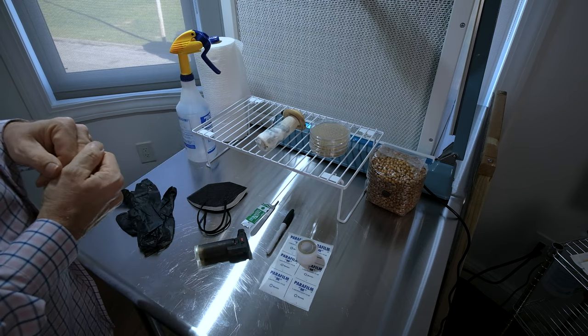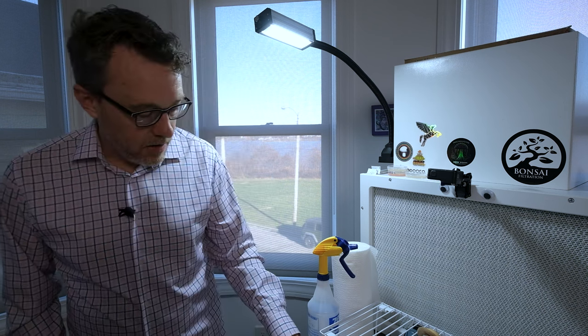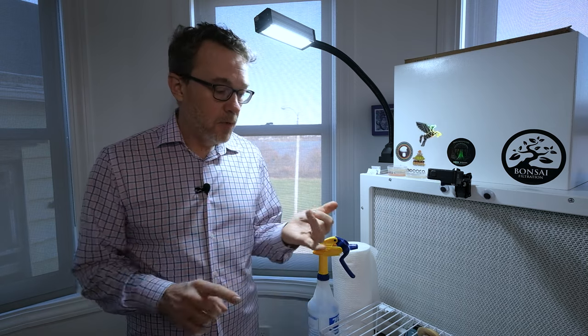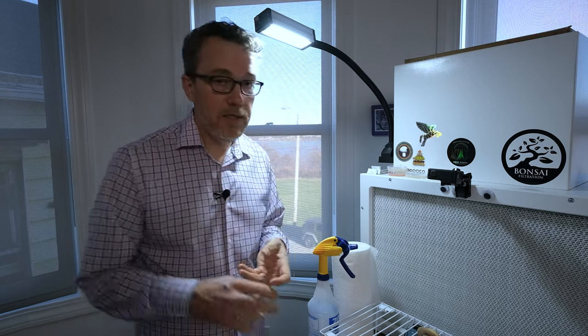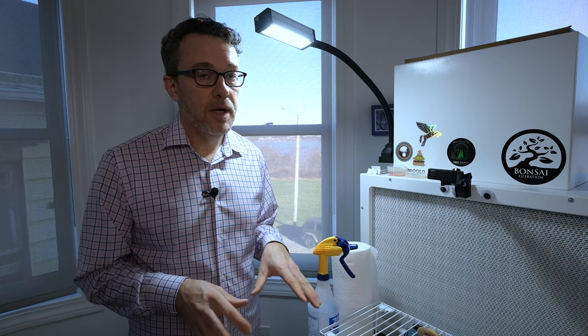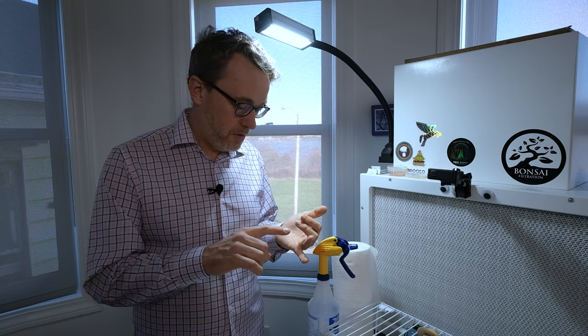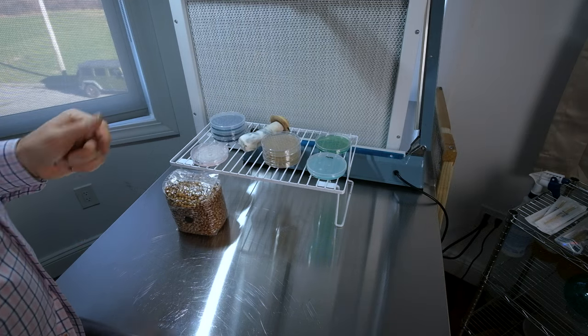The hardest thing in mushroom cultivation is getting clean grain spawn — if you can achieve that, it's 90% of successful cultivation. Agar allows you to physically see with your eyes or a microscope whether your culture is clean. You can use agar to germinate spores, test liquid cultures, expand cultures you've selected, and it works with every kind of mushroom. A good foundation of agar knowledge is critical — you can pick faster-growing cultures, clone, and clean contaminated cultures.